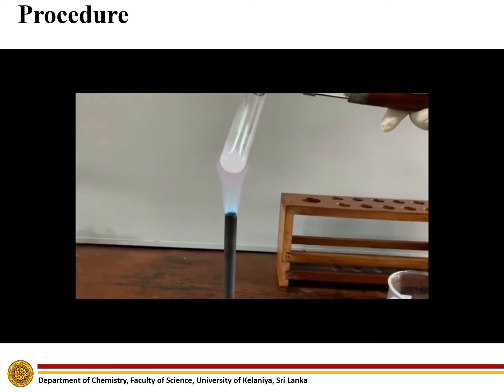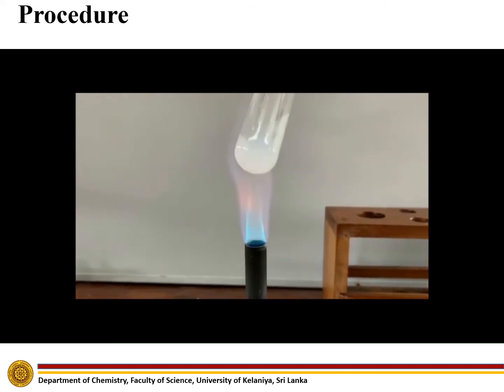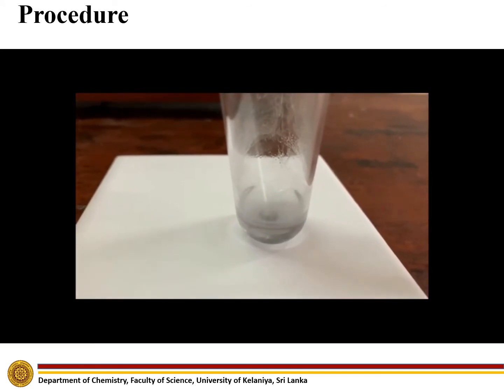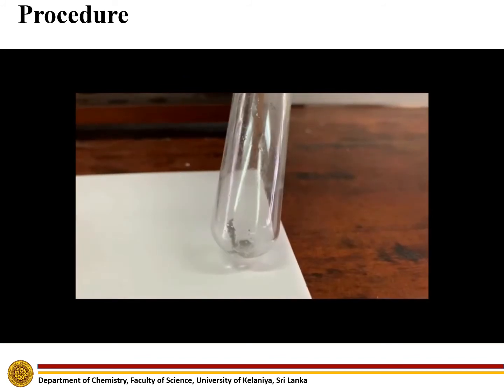Heat the resulting solution for several minutes. When heating, the precipitate color will change to black.